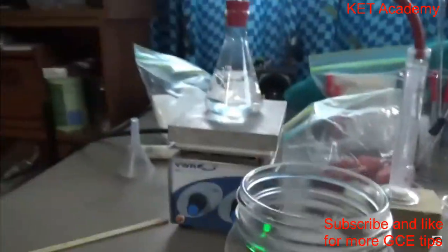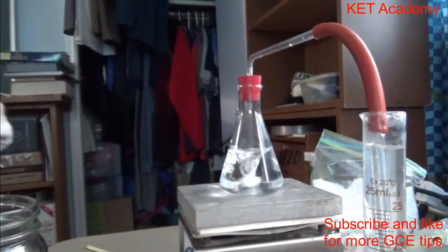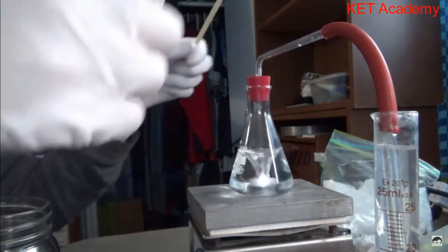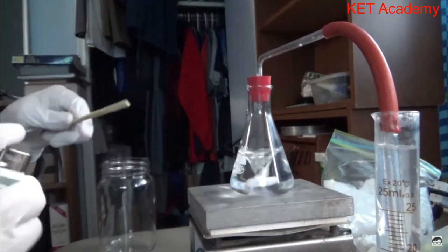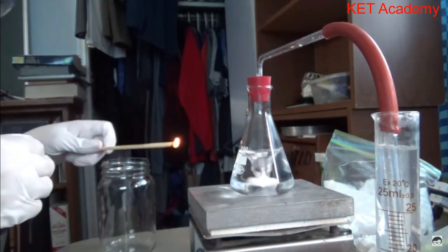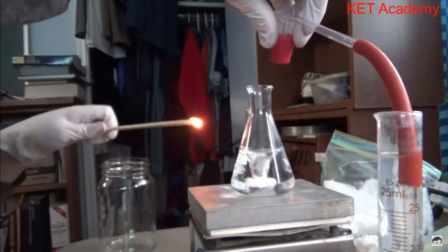Hopefully you can see alright. I'll put you over here, actually. Okay, here we go. We are still producing gas. I'm gonna light this. Actually, no. Let's see. Here. Okay, that's lit on fire. Just like that. Do that there. Pop this. See what happens.